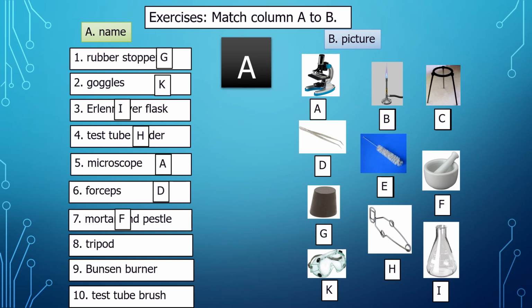The answer is letter C. Next, number 9, Bunsen burner. What letter? Letter B. And then last, number 10, test tube brush. The answer is letter E.